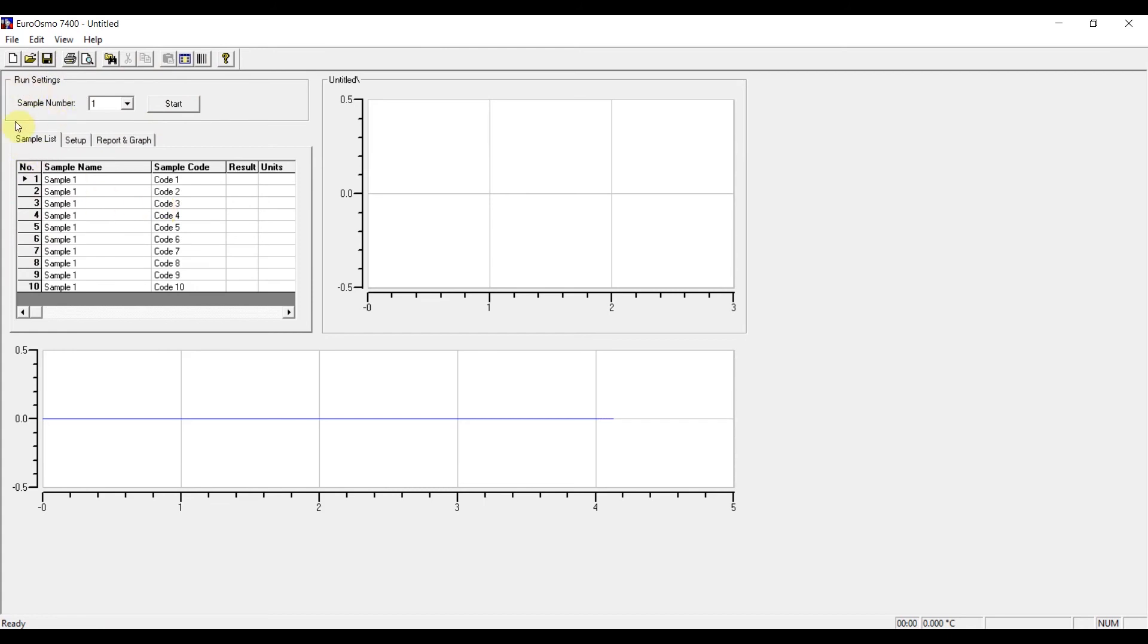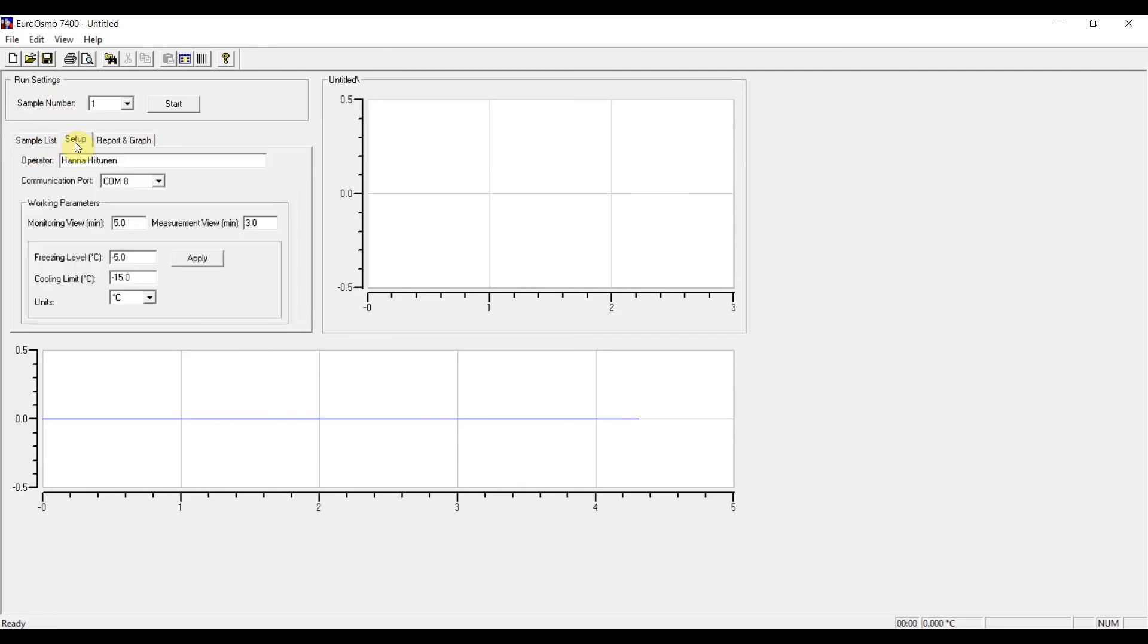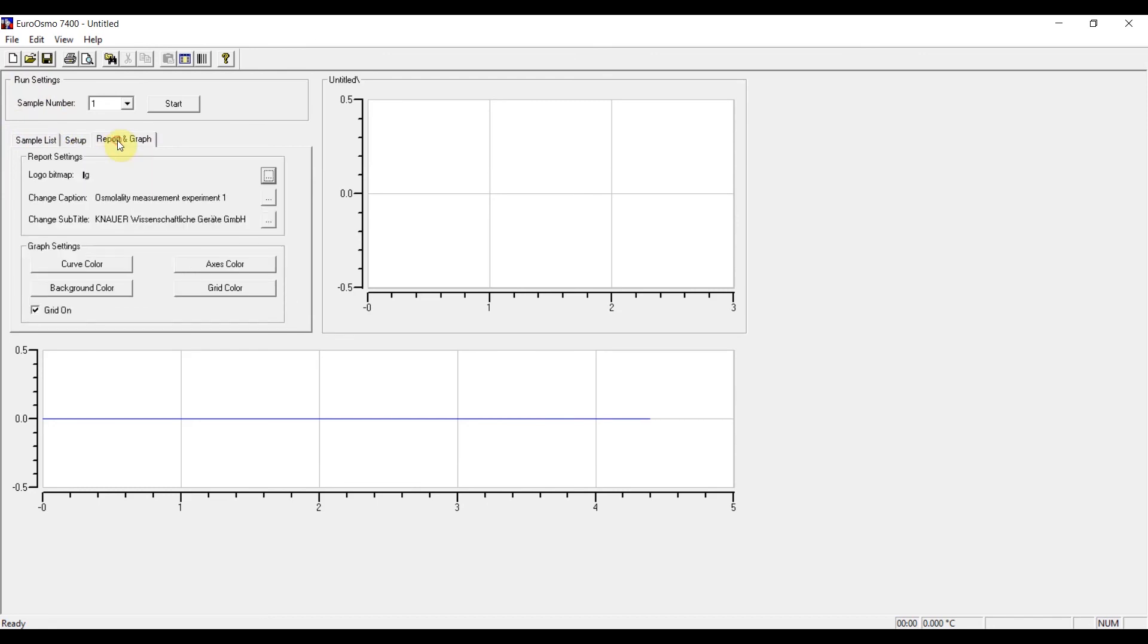Below the run settings we have the three tabs. Here the first tab is the sample list. In the second tab we have the setup. And in the third we have the report and graph tab where we can customize report or also the graph.